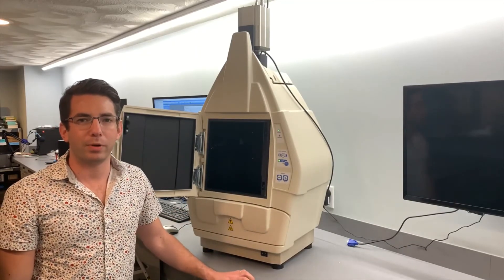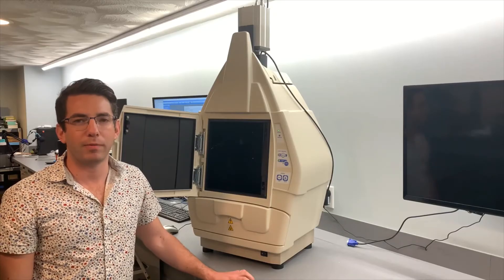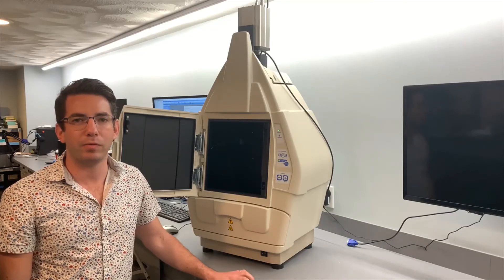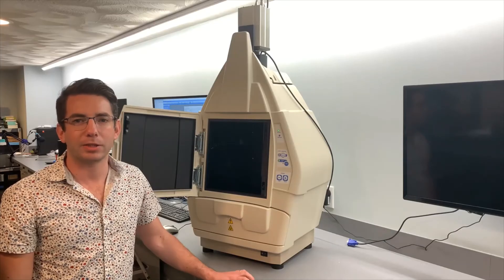We make sure that every one of these imagers is calibrated and refurbished to manufacturer specification. If you're on a limited budget, we can offer a Chemidoc MP without red, green, and blue lights, or we also have the Chemidoc XRS series as well as the GelDoc series, which does not have chemiluminescence.